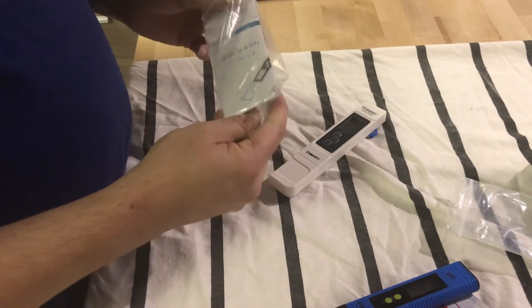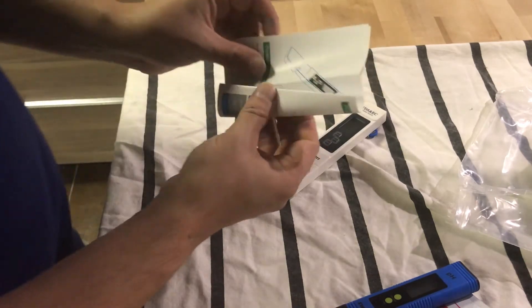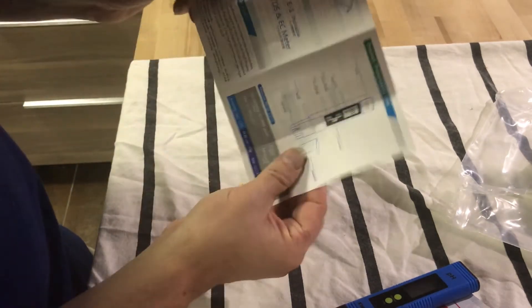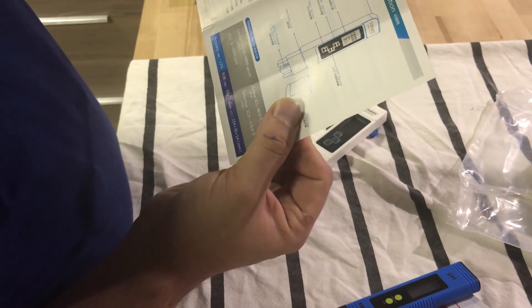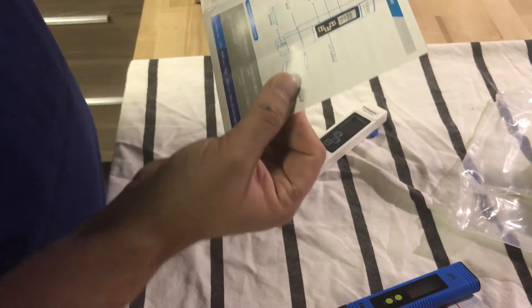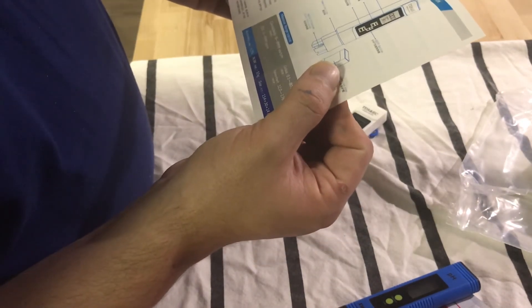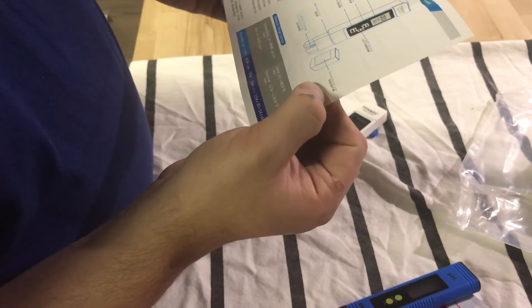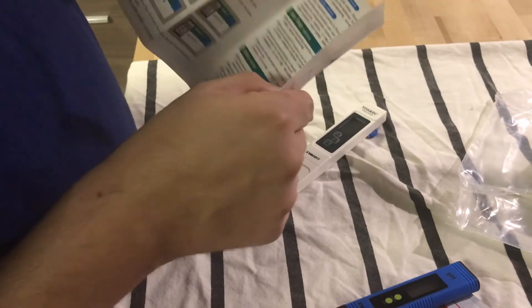There's a way to calibrate this. On the TDS meter I can see the battery case, LCD screen, on and off button, hold button, immersion line, and protective cap — so a bunch of stuff on here that I gotta read.